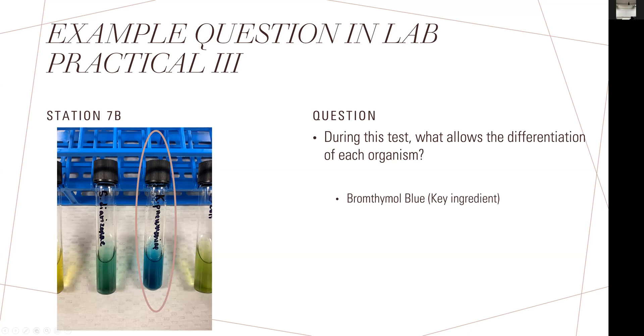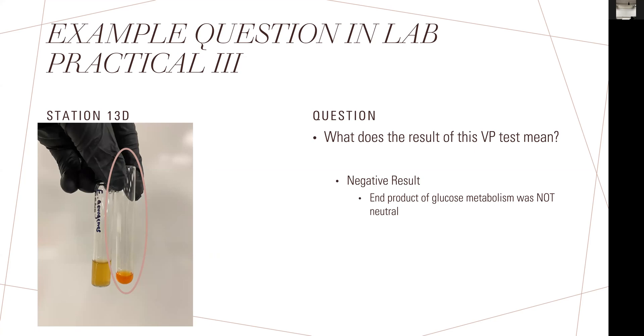Let me give you slightly different variations. This is a VP test you're seeing on the left, stands for Voges-Proskauer. In this case, you'll find out what it does and how it does it; that's part of your pre-lab understanding. But what I'm showing you here is the result. It's asking, what does this result mean? You'll need to look this up, but as you can see from the color, it looks yellowish orange. Once you read the lab, you'll find that when it remains yellow or orange, that's the negative result. This organism does not consume glucose without acidifying it, so it doesn't really change. In reality, to get a positive result, it actually turns red when you add the correct reagents.